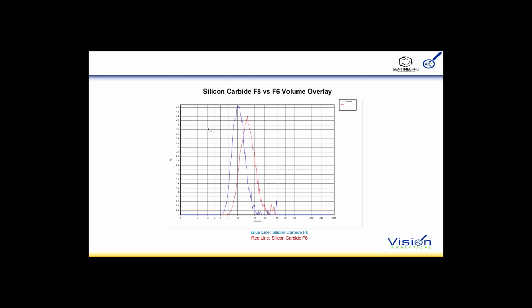The Particle Insight Sentinel Pro can look at particles similar to a particle counter. If you make sure that the concentration of the particles in the liquid, or in the case of the laser, the obscuration, is such that we capture an image that has just a single particle, then the Particle Insight becomes an equivalent to a particle counter, where the laser can never do that kind of task. But the Particle Insight isn't really functioning as a particle counter because it's dynamic. We might be seeing the same small particle more than once, but we're seeing that in the case of the laser also. But if we only have one particle per image, we now can use the Particle Insight as a pseudo particle counter.